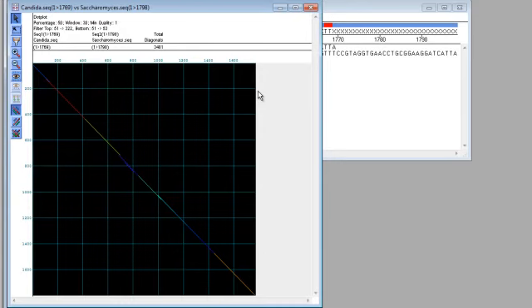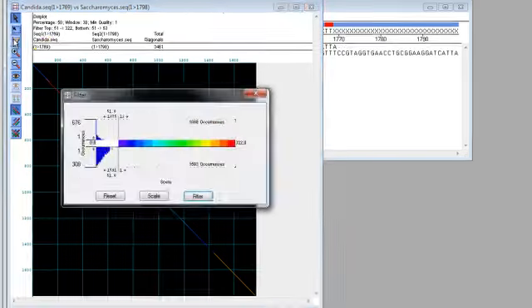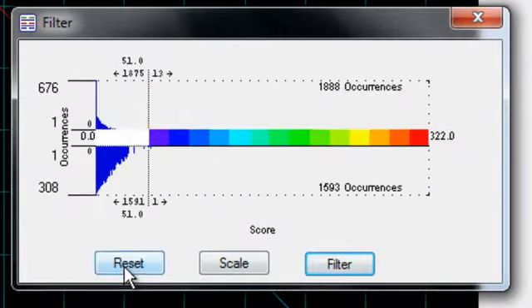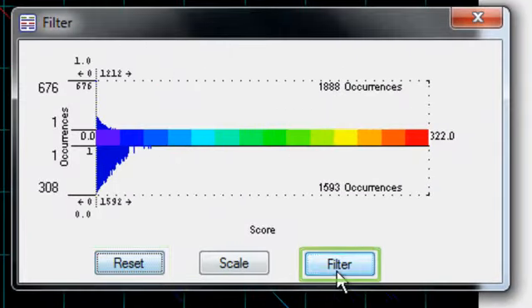I can reset the view to the original display by using the filter tool again, clicking reset, and then filter.